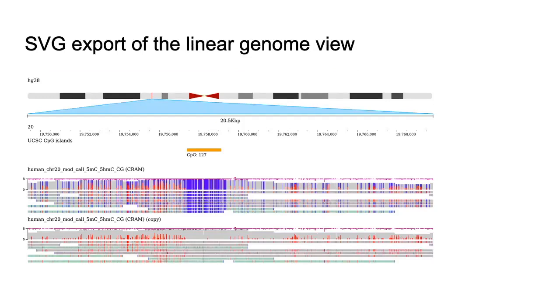And also fun, we can create SVG exports. So that can be put into your publications, high quality stuff. And that's that same figure.